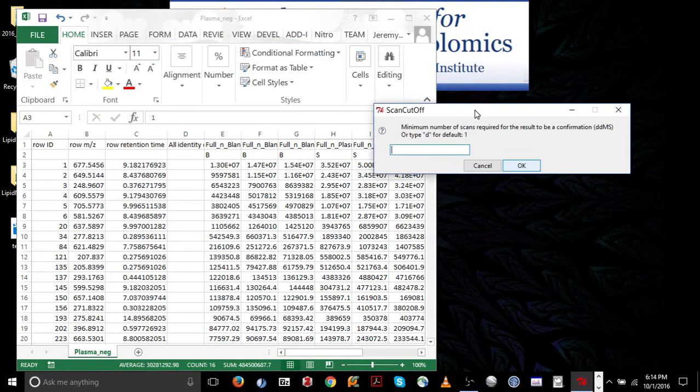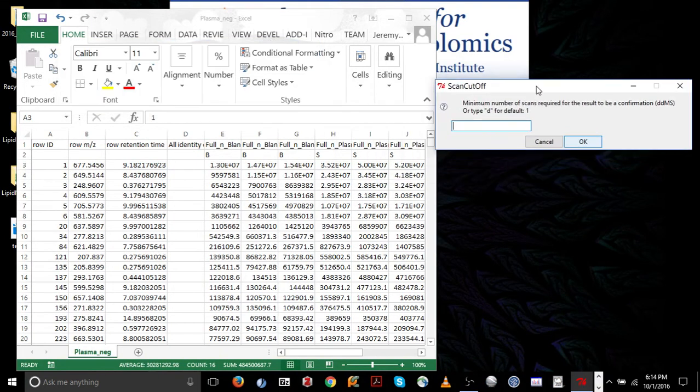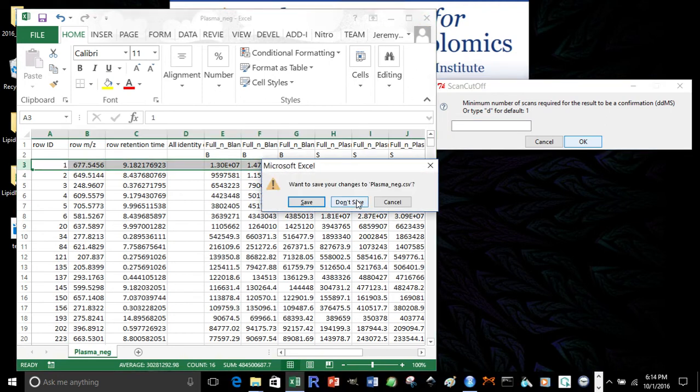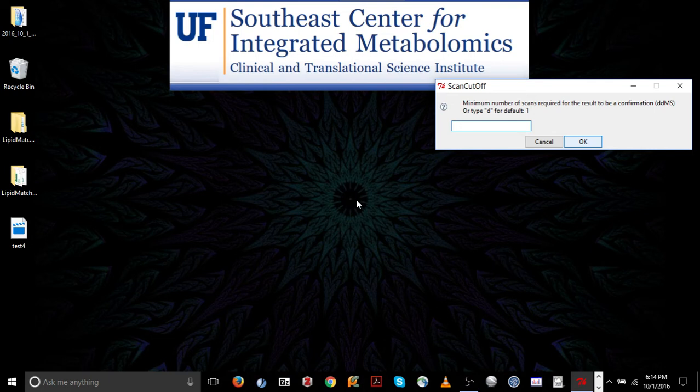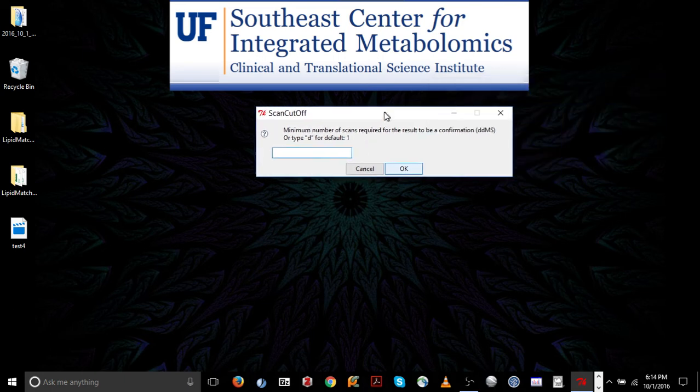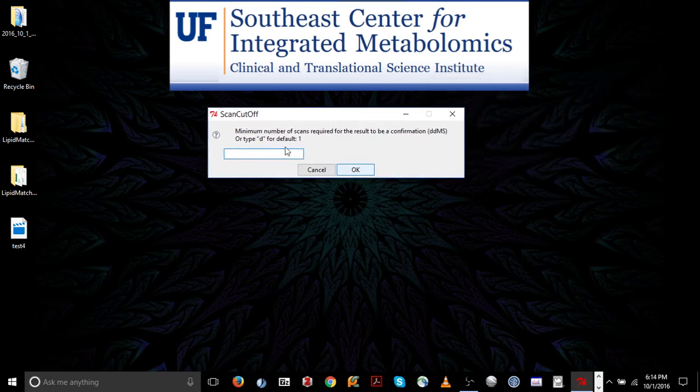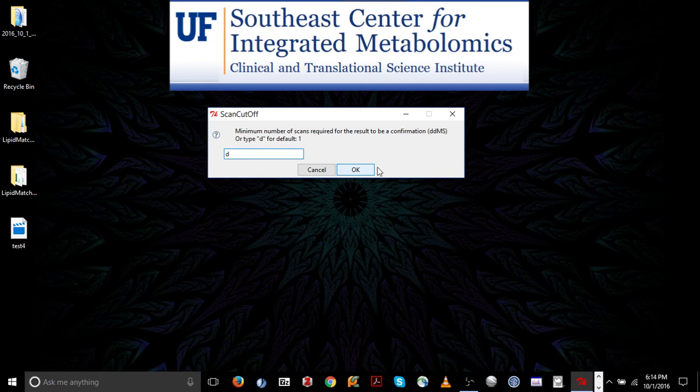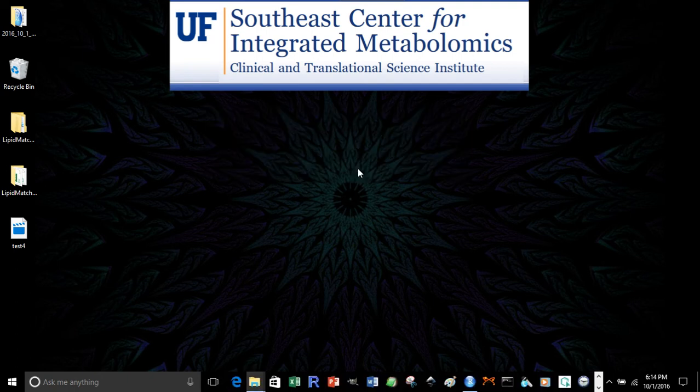Now after we've completed, before we complete this last pop-up box, make sure to close the CSV file. You want to make sure that all files which lipid match are going to use and access are closed at this point. The final parameter is the minimum number of scans required for fragments to be confirmed. So for example, do you need to see three scans across a peak with all the MSMS information or only one? In the case of an Orbitrap, one scan is usually enough. So you press OK, pop-up boxes disappear.